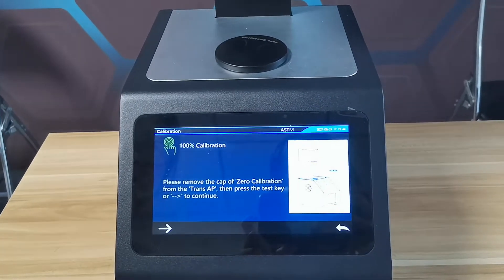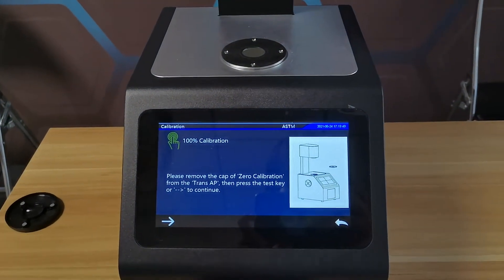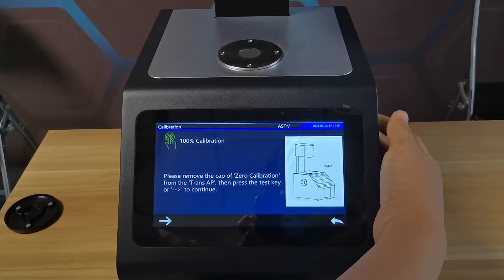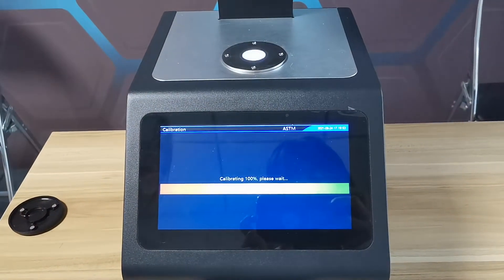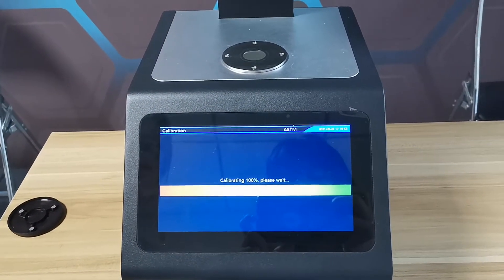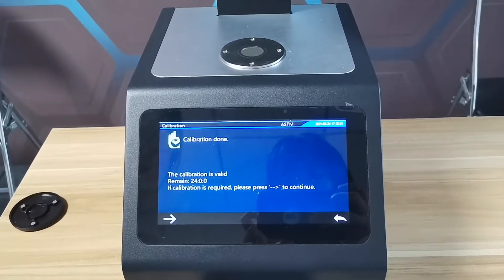Calibrate in. Then remove the calibration cover. Calibration completed.